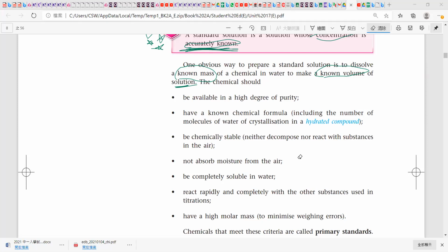你唔需要知啦，即係究竟佢嗰個水係咪有100 cm cube，令到個 solution 有100 cm cube 啦？呢個已經唔係重點啦。個重點係你要個鹽溶咗落啲水之後，最後個 solution 係100.0 cm cube。呢個先係 what we are looking for. But it is not how accurate the 100 cm cube of water is. It's meaningless now. 明唔明？ So in order to prepare the standard solution, you go back to the solute.